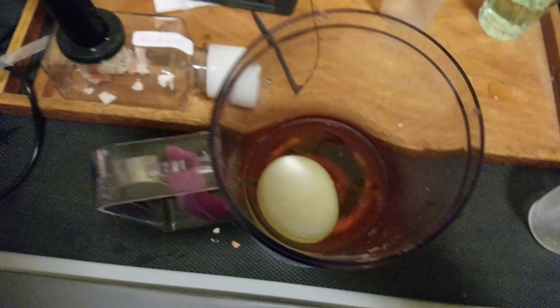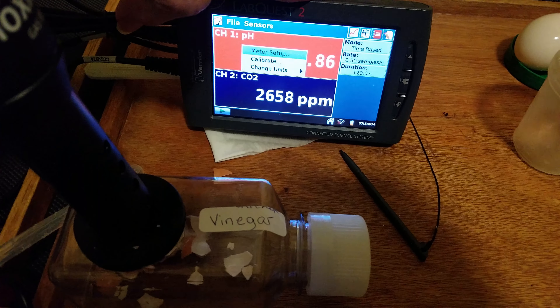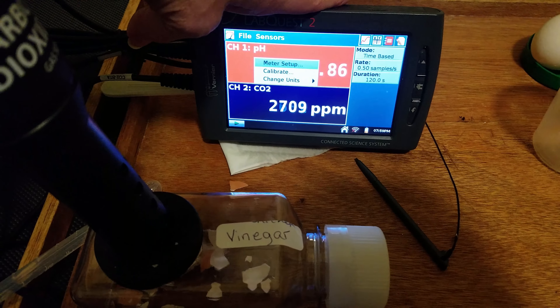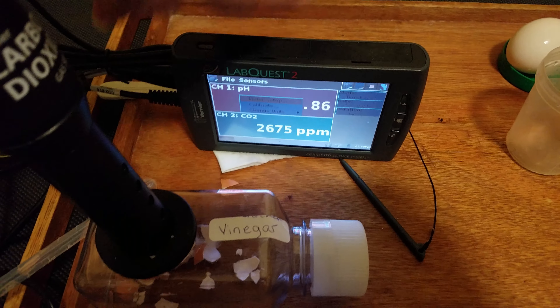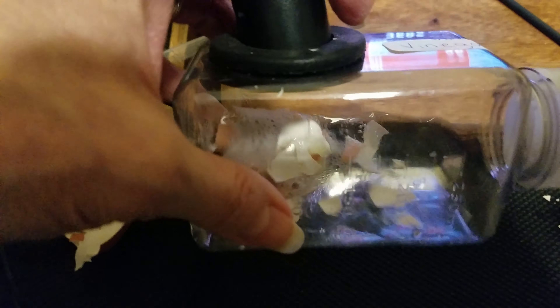I don't want to forget to show you what's happening here with the carbon dioxide. The carbon dioxide sensor is telling me there is over 2,600 — now actually exceeding 2,700 parts per million of carbon dioxide in my chamber that contains the new pieces of eggshell. If you look closely, you can see there are definitely bubbles going on in there, proving that one of the products of this reaction between calcium carbonate and vinegar releases carbon dioxide as a product — even though we can't see it because it's a gas, we can detect it using special sensors.